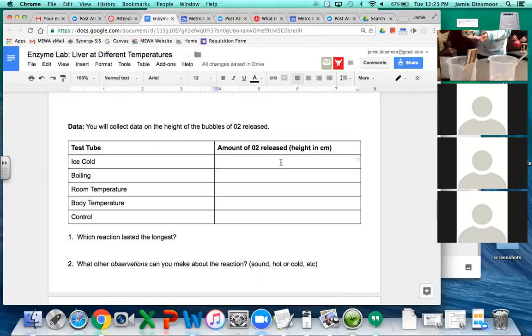Record the reaction. So we're currently chilling 2 of them, room temp and ice cold. We're testing the chicken liver in room temperature and in cold water. And what are we testing it for? Cure for cancer. That is gross. Release. So we're measuring the amount of oxygen that's released when you pour hydrogen peroxide on the liver. The liver has enzymes in it, and it'll break down the hydrogen peroxide.